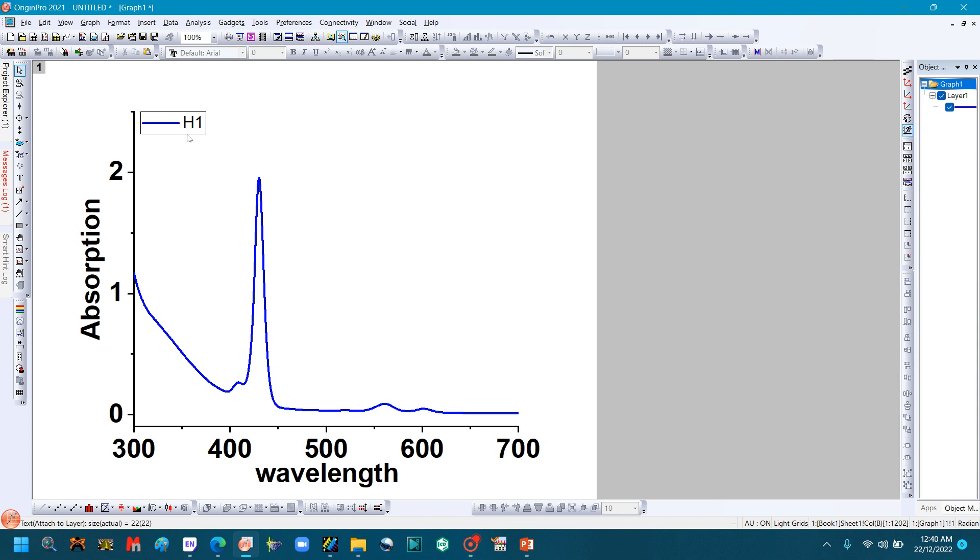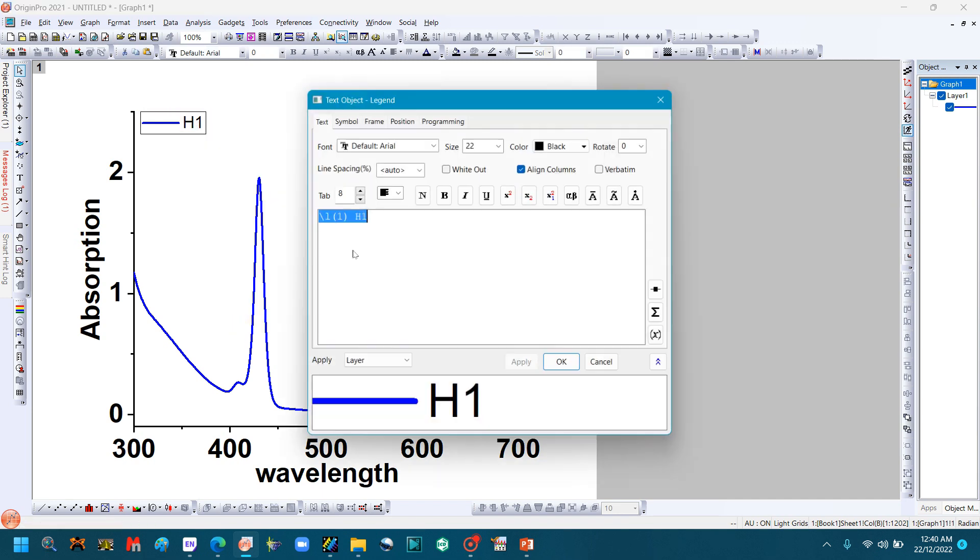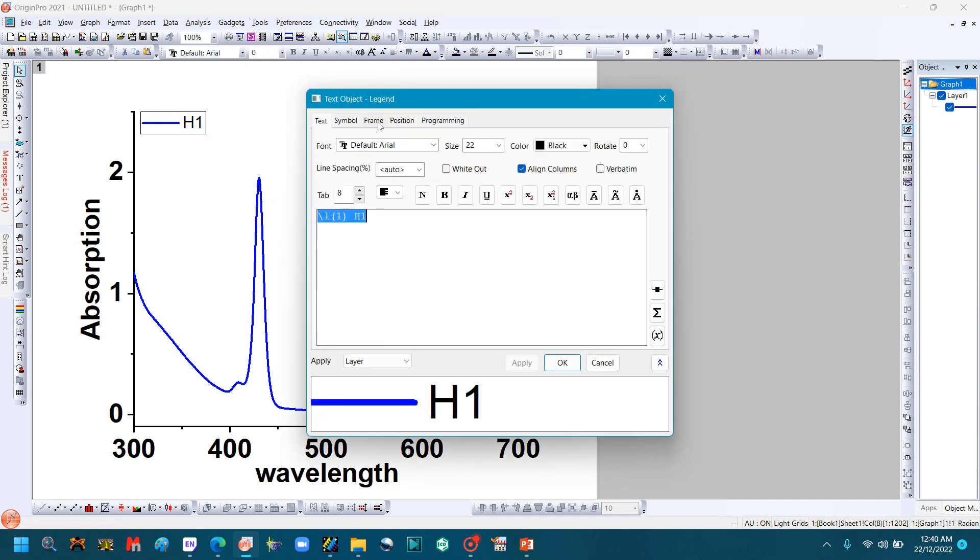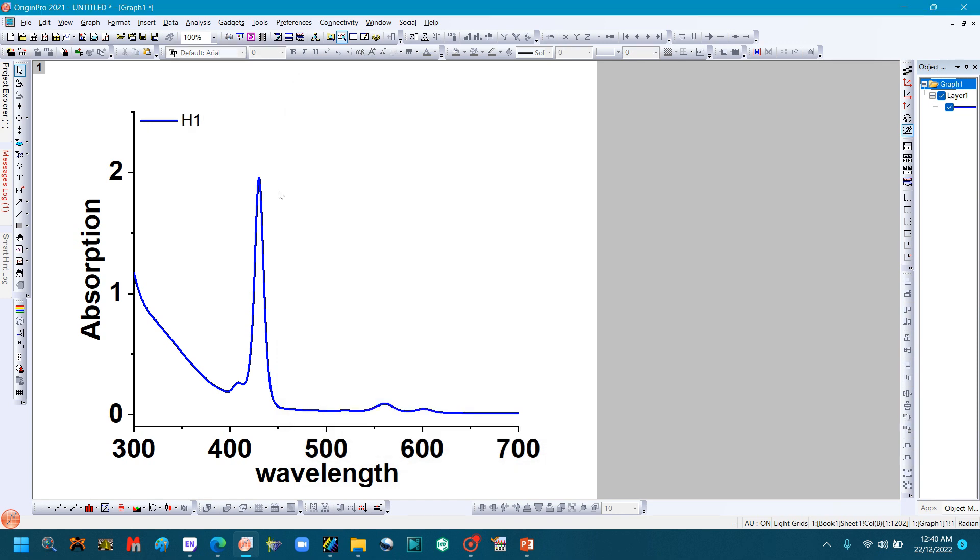You can also remove the box here. Right-click, go to Properties, go to Frame, click Box, and click None. Press OK. So I think the graph is looking good.